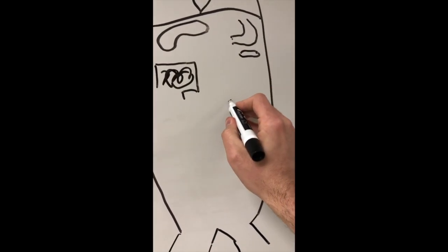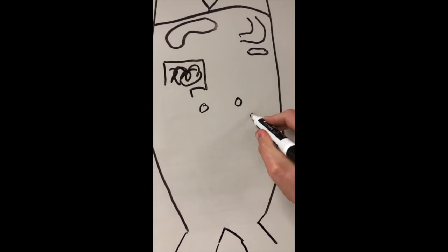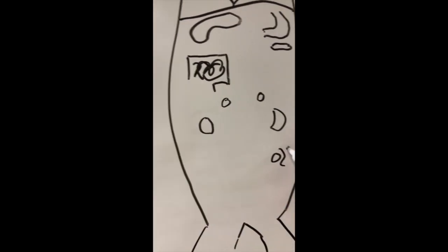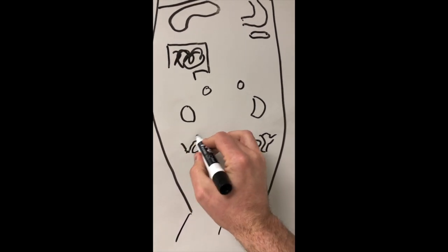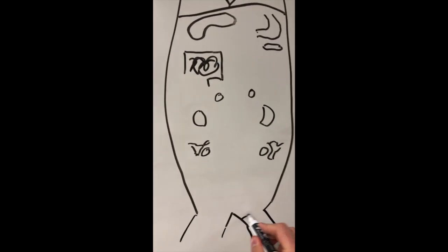So we'll put in the adrenal glands right here. We'll do another little mock-up of some kidneys off here on the side, and then we'll put in a quick representation of some ovaries, some of the gonads. We'll just assume this is a female mink. So another little ovary, fallopian tube type thing right there. And then we'll go ahead and put the inguinal ligaments right here.